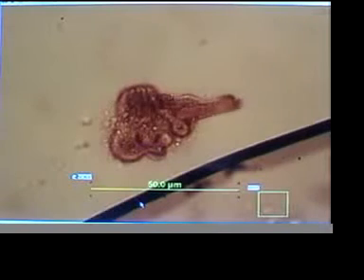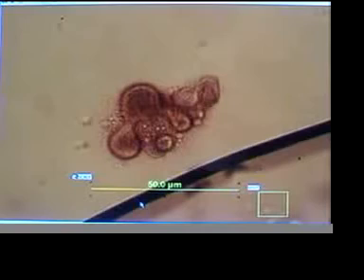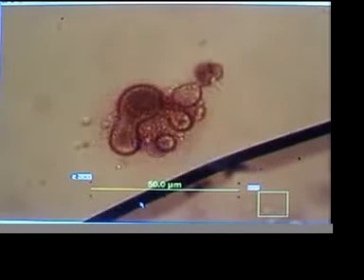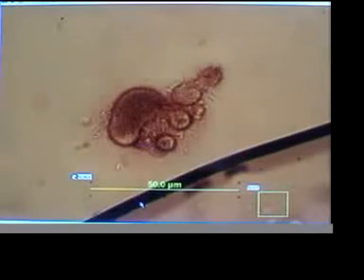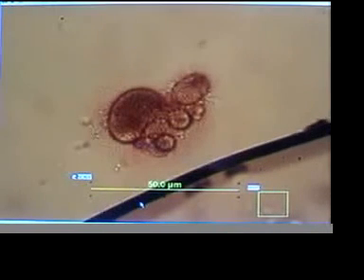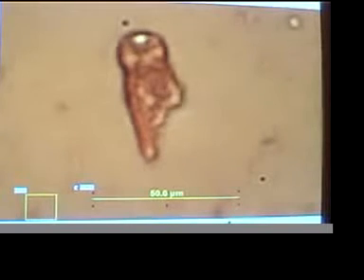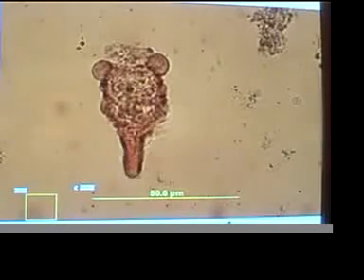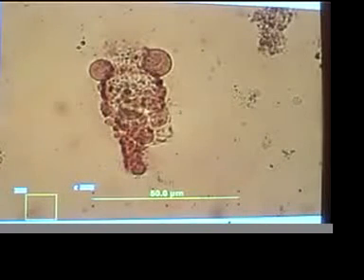Just now, he suddenly and dramatically disintegrated at 926 hertz, at the end of the third minute of 926 hertz. Oops. There you go, let's watch live. This is real time. Complete total disintegration.